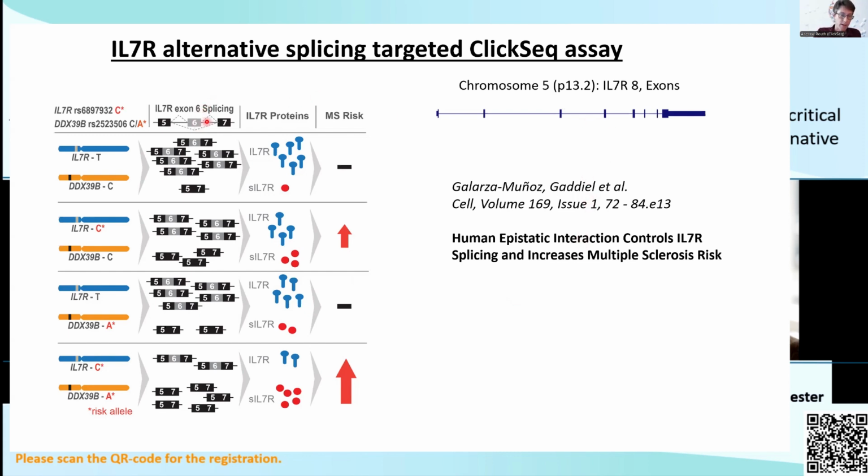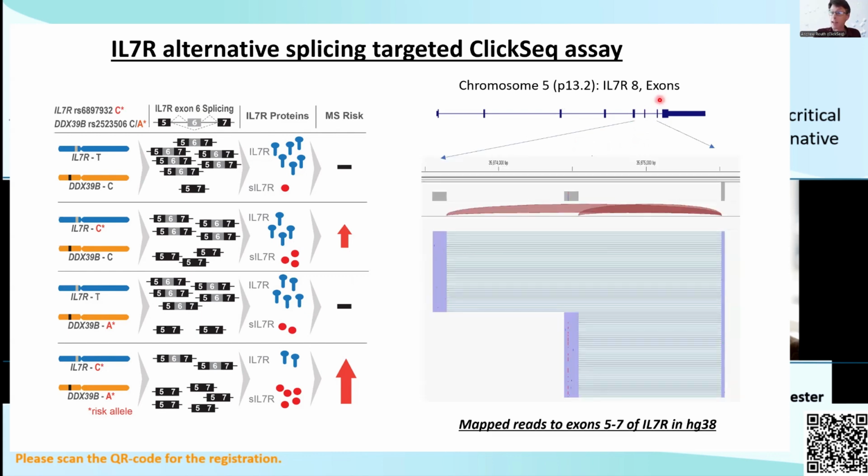And so this exon 6, I think it's this one right here, we designed primers that targeted exon 5 so that we could sequence through exon 6 and map the frequency of mutations in these samples. And so this is just one primer. Remember, we don't have to design multiple primers. If we want to measure the splice event, we don't need to design a pair of primers for every different splice event that might be there.